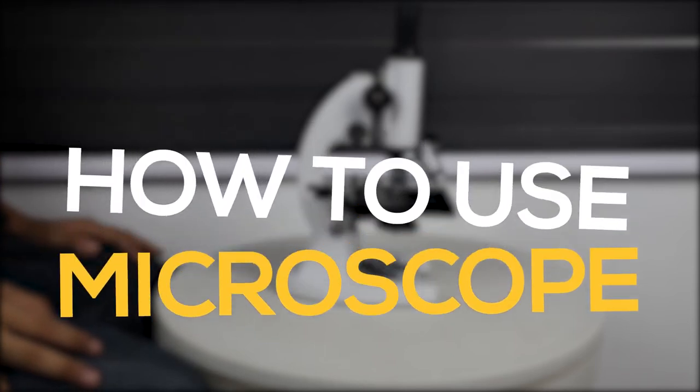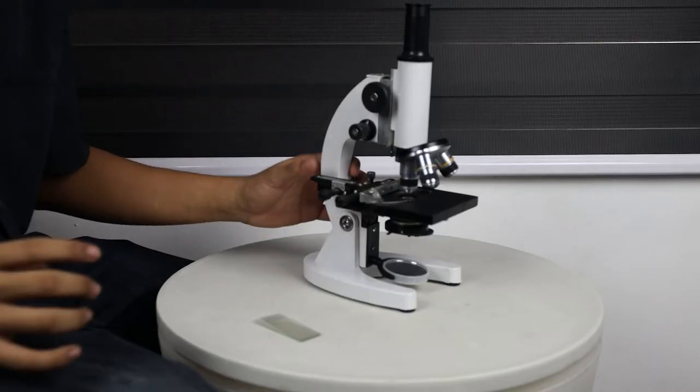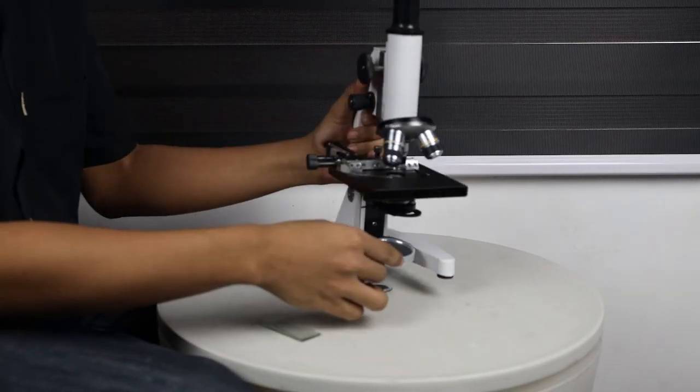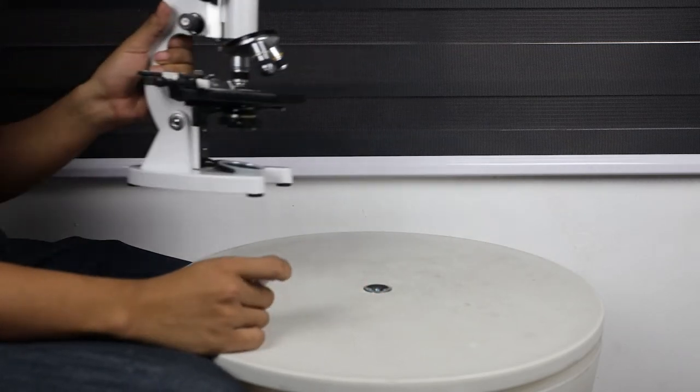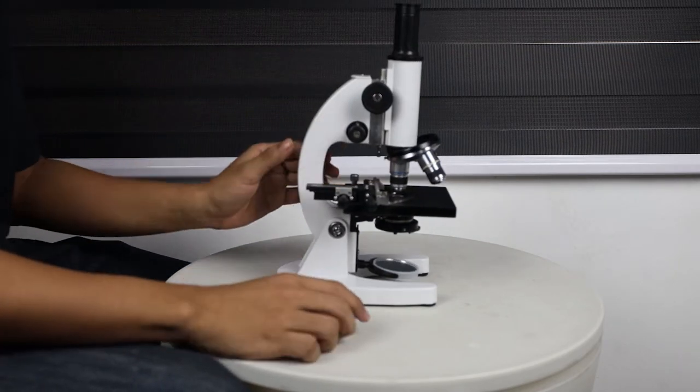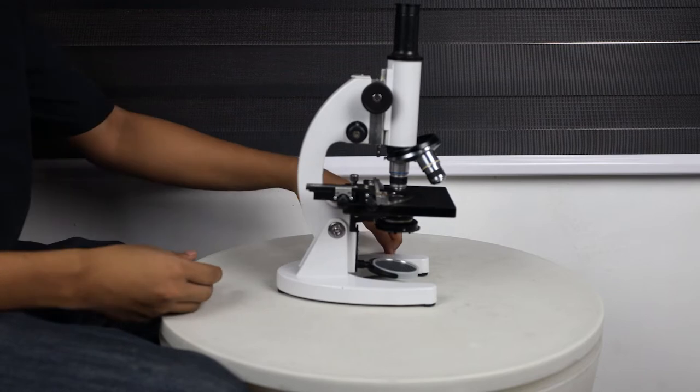These are the following steps on how to use the microscope. Step 1: Adjust the angle by one hand pressing the U-base and the other hand pulling the stand to a comfortable position for observation.